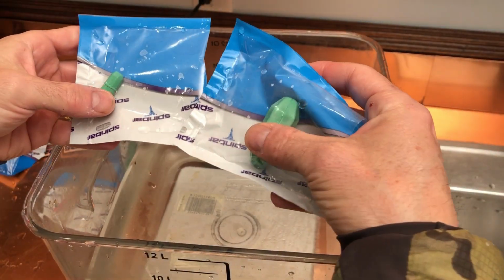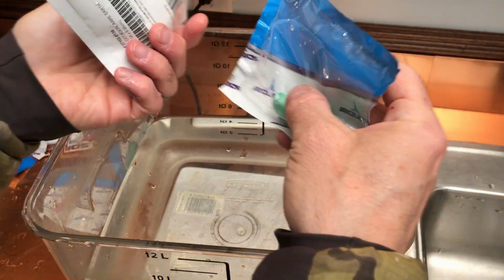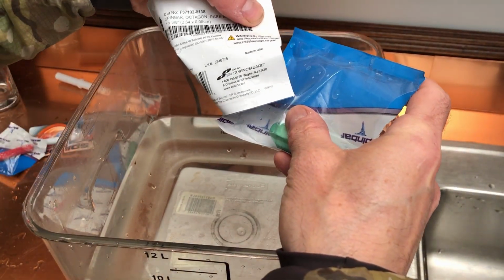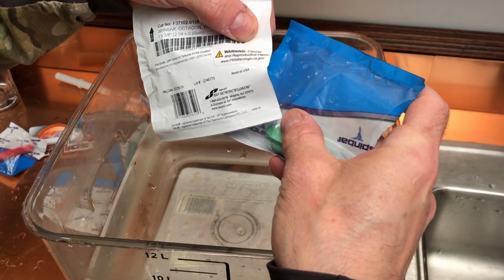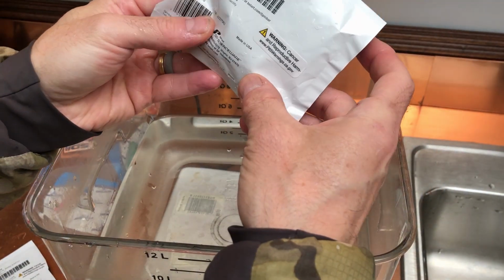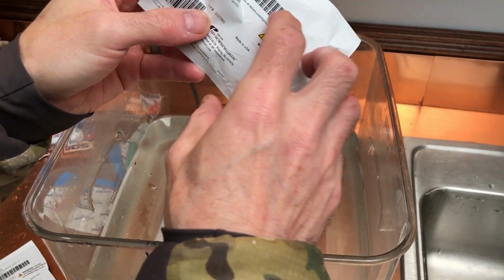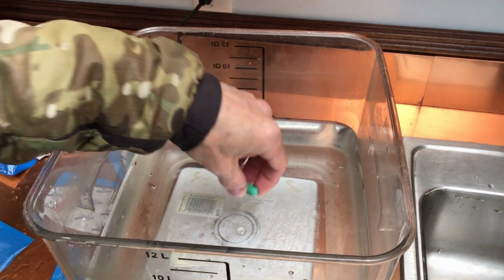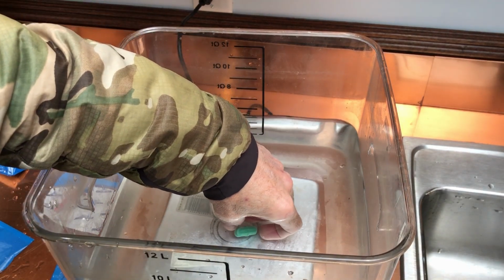All right, so I saved the best for last. These are small green ones. And this one is a 1-inch or 25.4 millimeter. And this one is a 2-inch or 50 millimeter. Let's try this little green one.